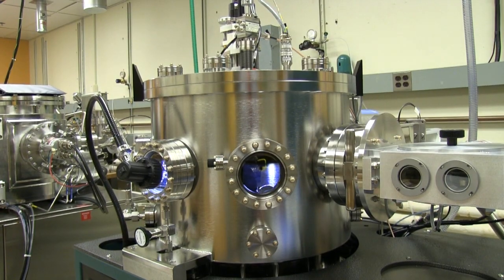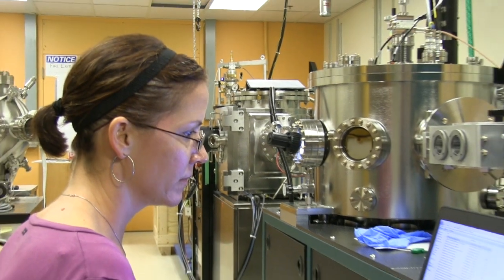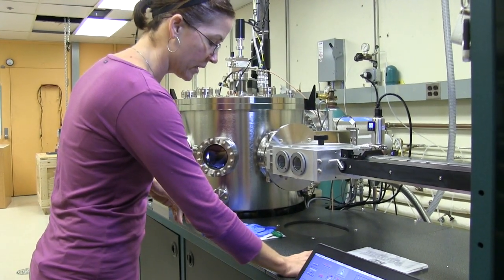I'm working with a lot of new equipment like the vibrating sample magnetometer and the sputter to lay down thin films. I always go back to the checklist just to make sure I'm doing everything in the right order.